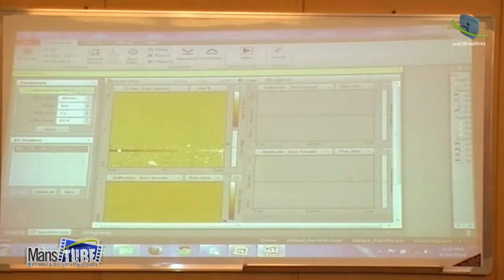What I do, let's say we start with the basic one. So I have the offset as minus 600 nanometer. So what does it mean? If this is like 0, minus 600, I am here. Minus means I am far from the surface. And then I can set the range, how much I want to go down. Usually, if you have minus 600, you go down around the same value or a little bit more, not 1 micron. This micron will make too much, so it may go too much inside the material.